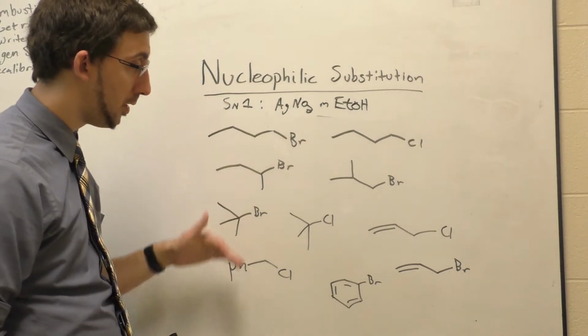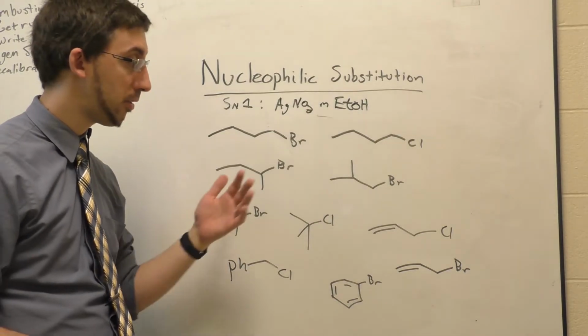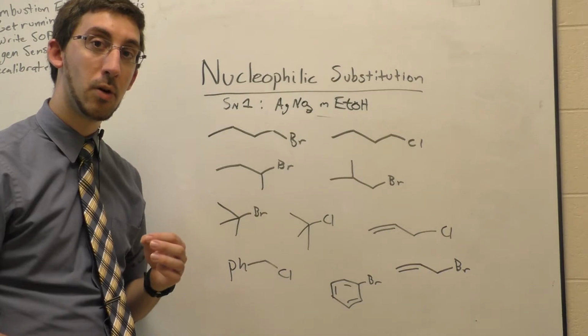And so we'll do these for all 10 of these substrates, and then we'll be able to compare the effect of substrate structure and, in certain cases, identity of the leaving group on the overall rates of the reaction.